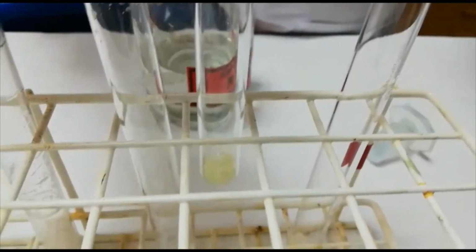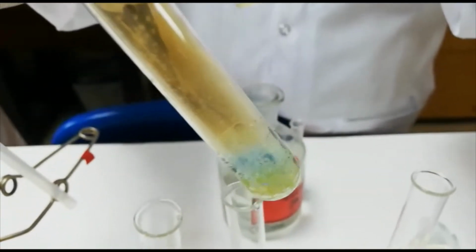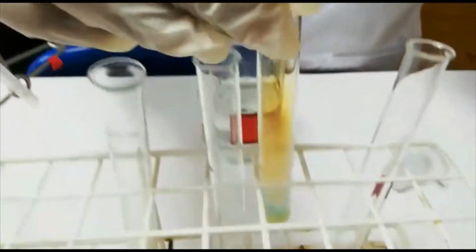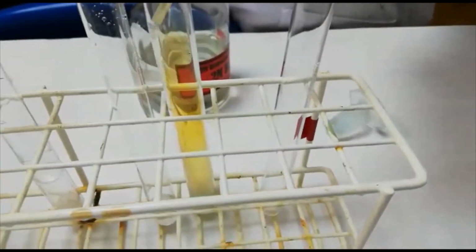And third one, nitrite. When we add HCl, the group reagent, you can see that brown colored gas is produced, NO2. This gives you the idea that the given salt is nitrite. It will be containing NO2 like potassium nitrite, calcium nitrite, sodium nitrite, etc.